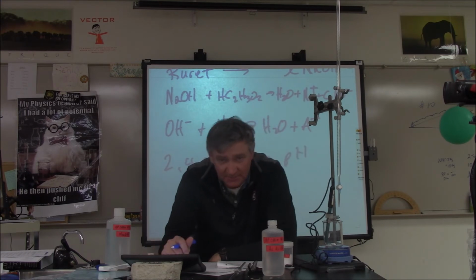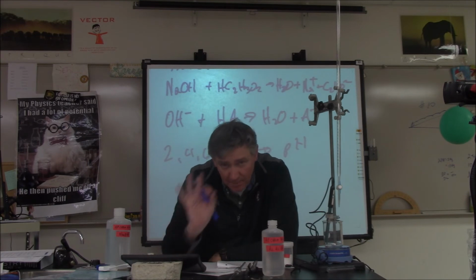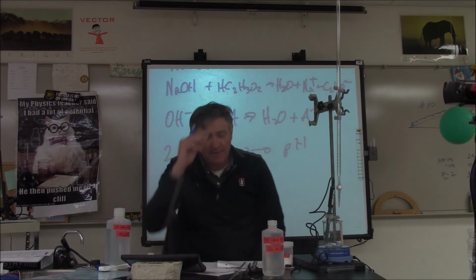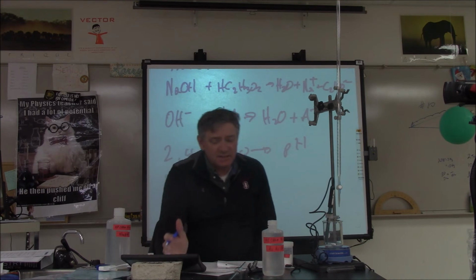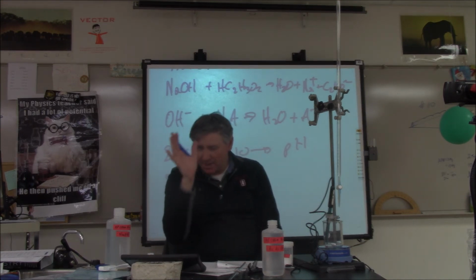Record the pH after each one of those. Then I'd start going by ones, like 11, 12, and I would do that probably till you hit about 16, okay? Once you hit 16, then I'd start going in really small increments, maybe a half, maybe a couple of drops, something like that.